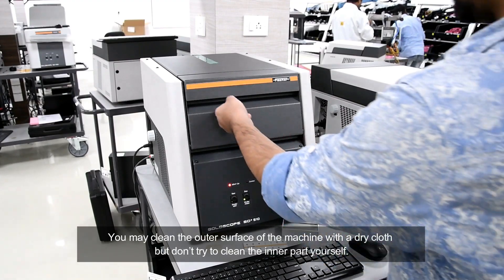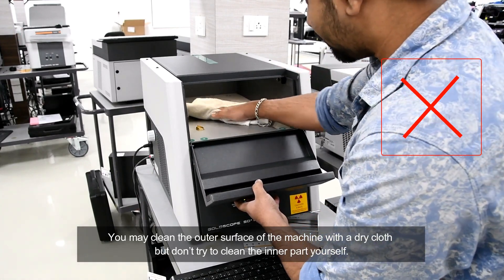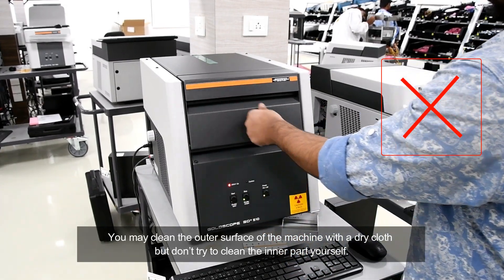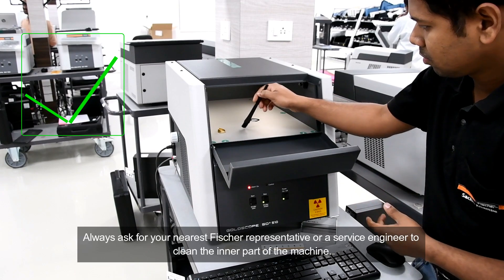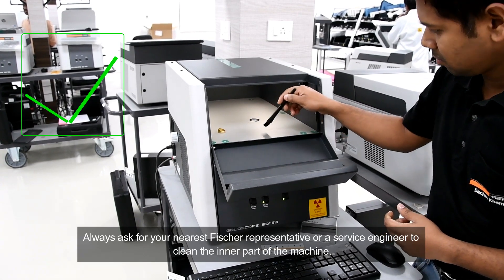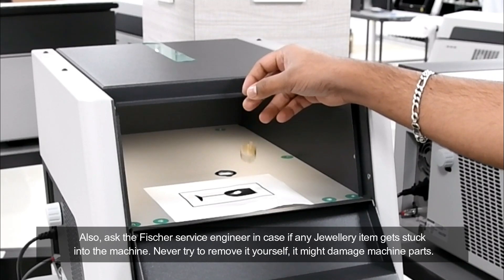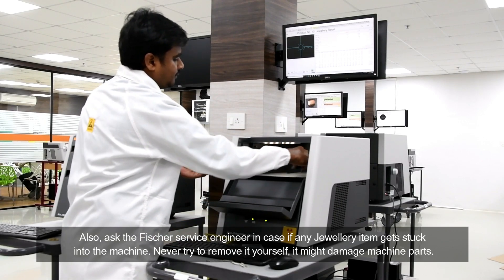You may clean the outer surface of the machine with a dry cloth, but do not try to clean the inner part yourself. Always ask your nearest Fisher representative or a service engineer to clean the inner part of the machine. Also, ask the Fisher service engineer if any jewelry item gets stuck in the machine — never try to remove it yourself, as it might damage machine parts.